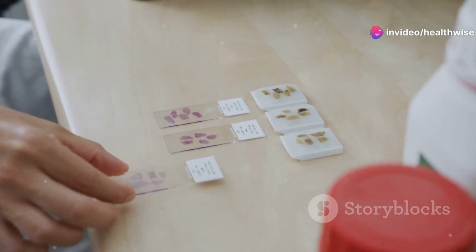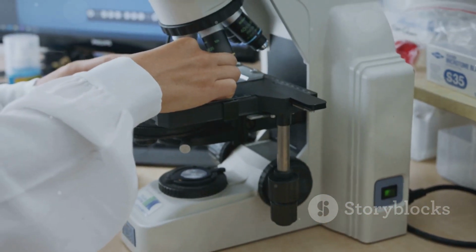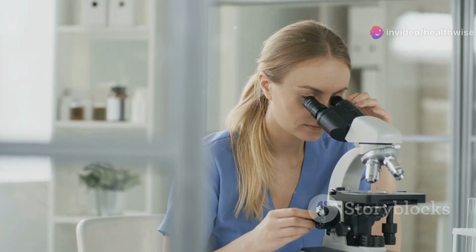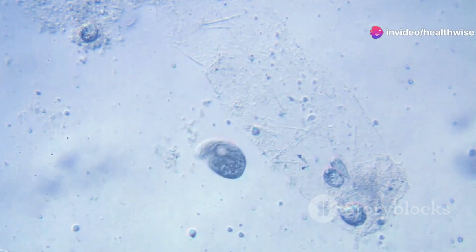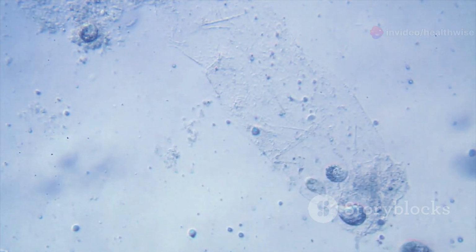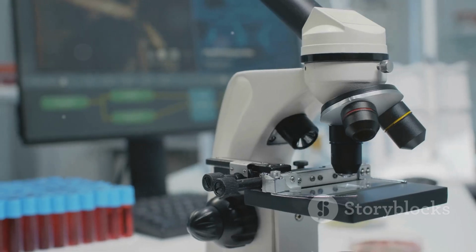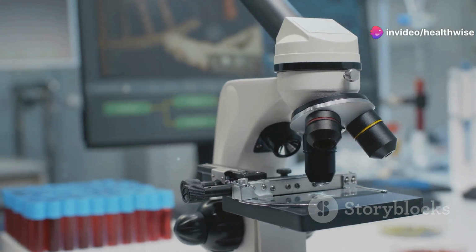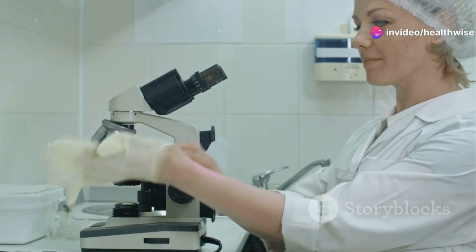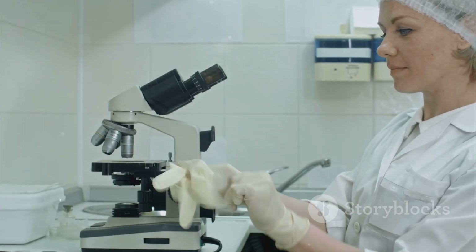For better contrast, add a drop of Lugol's iodine from the edge of the cover slip. This can enhance the visibility of certain structures. This can stain some inclusions of protozoan cysts like glycogen mass, making them easier to identify. Remember, normal structures can sometimes be mistaken for abnormal ones. It's important to differentiate between the two to avoid misdiagnosis. Hair, vegetable fibers, starch cells, yeasts and spores, muscle fibers, fat globules, and pollen grains are all normal. These are common findings and should not be confused with pathological elements.